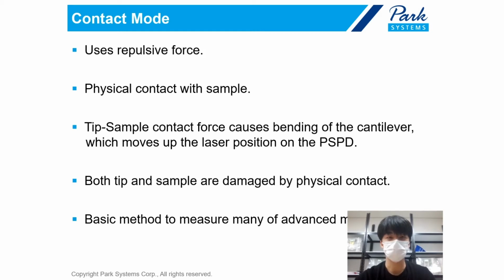But actually, contact mode is not a good way to image the topography because of its physical contact. It can cause some deformations on the sample surface. However, it is a very basic method to measure many advanced modes like conductive atomic force microscopy or piezo force microscopy.